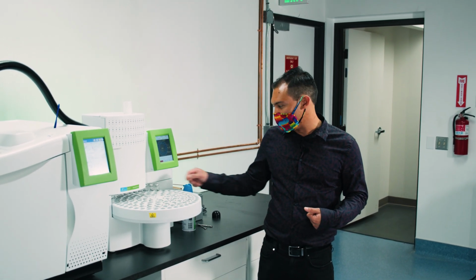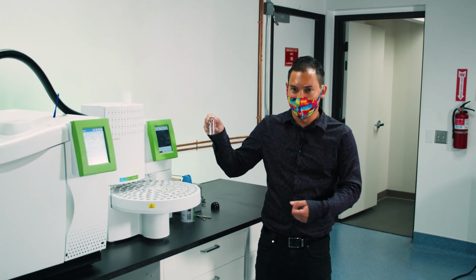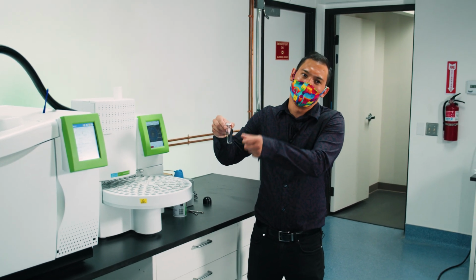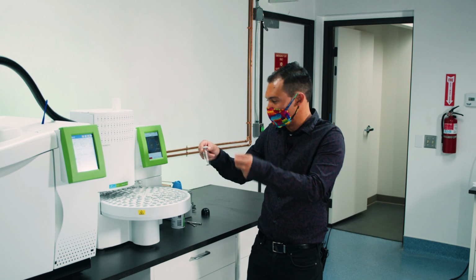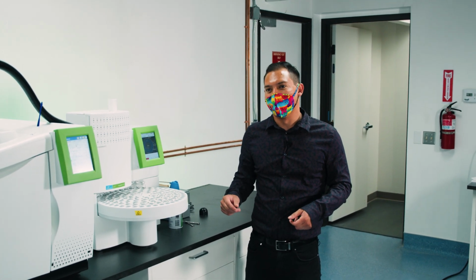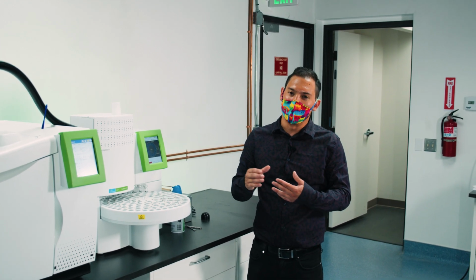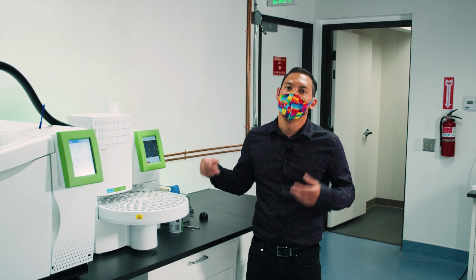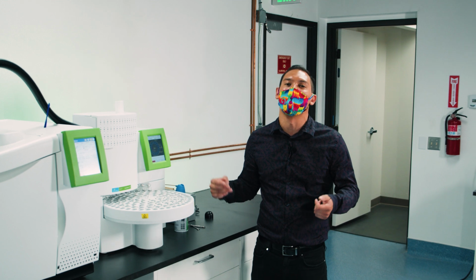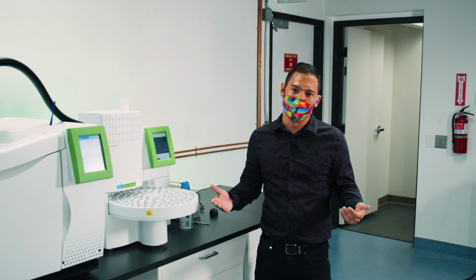One of them would be using these headspace vials, like we talked about before for residual solvents. And this is going to have it so that the terpenes volatilize into this, and then we take a small sample of it and inject it onto our column. Now, the other way we could do this is in a 2 ml amber vial, so using a liquid sample. The problem with that is, instead of having a very clean matrix as you would in the headspace vial, now you have a lot of other junk in there that is going to cause a lot of instrument maintenance to be required over time. So either way works, just depends on how clean you want the matrix.